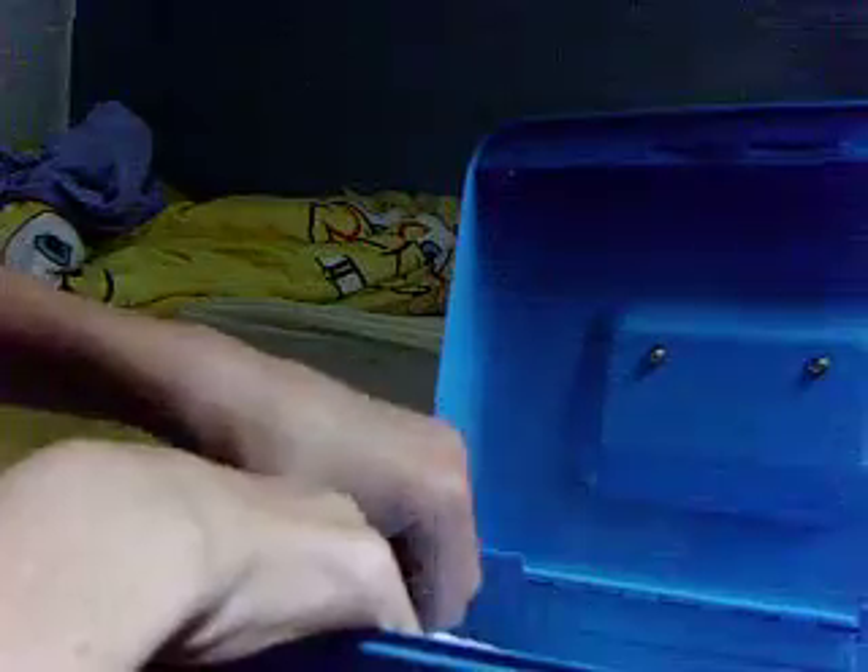Okay so we've got some goggles — I'll put on the screen what these are. So these are goggles. A spoon, I like that as well. There's something that stinks — this is the stinky thing. Some labels, a coat lid, a pen. Rubber gloves, always need rubber gloves in a science lab. Another pen and another one down there, and some pen, and black ink.